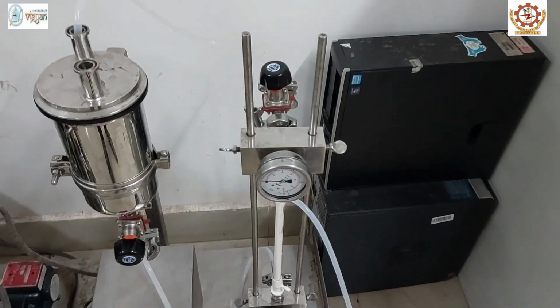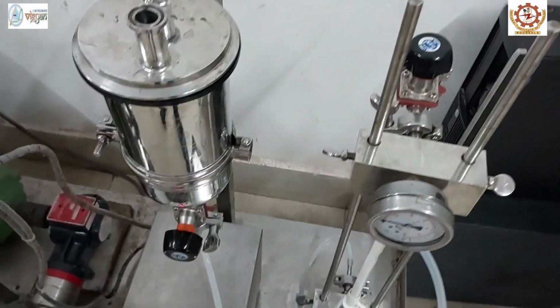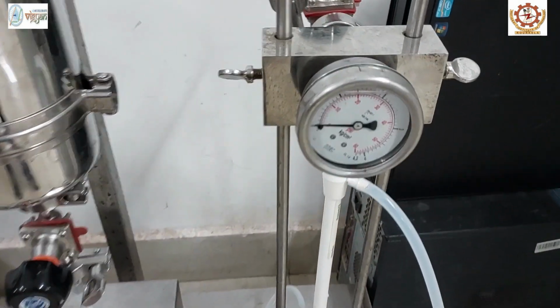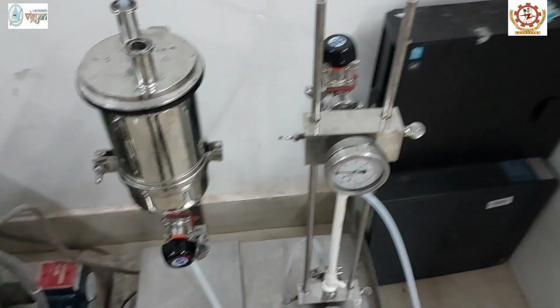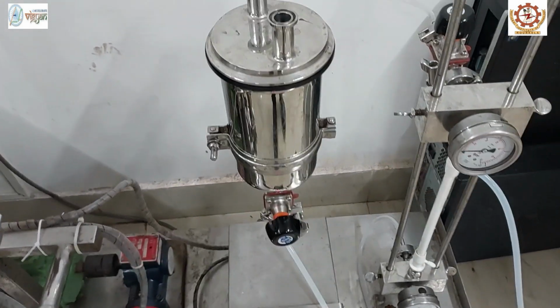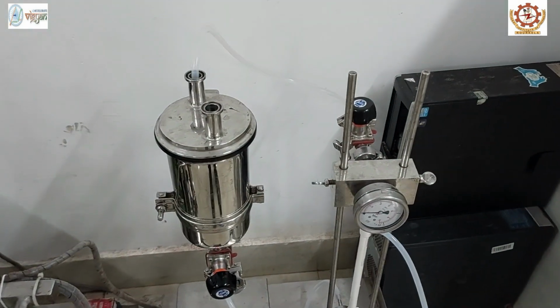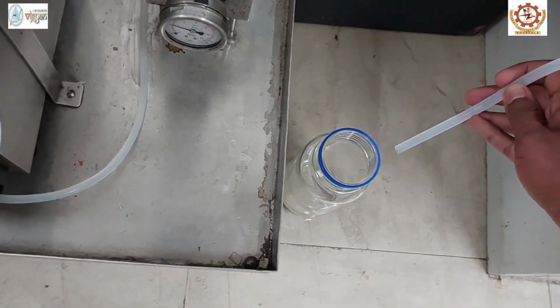Initially, both the pressure valves will be open. This time the inlet and outlet pressure gauges will read 0. Since the pressure is 0, there won't be any filtration. Whatever juice comes out through the membrane will be recirculated back to the feed pump. That is, there won't be any permeate.